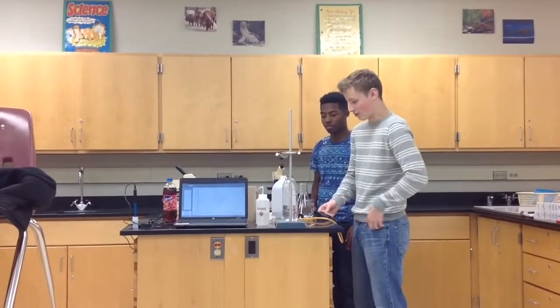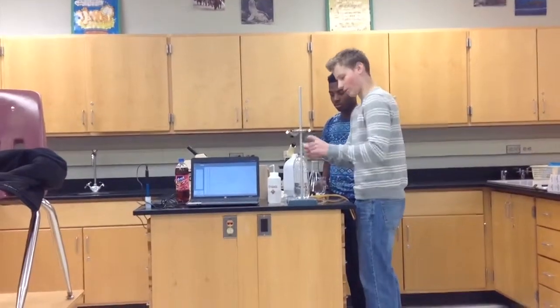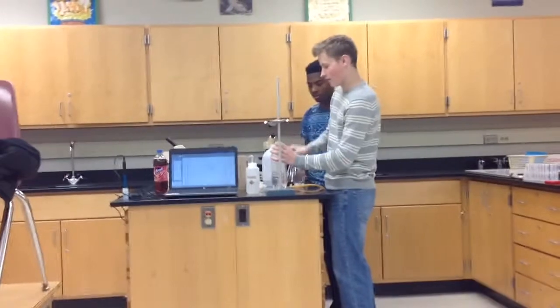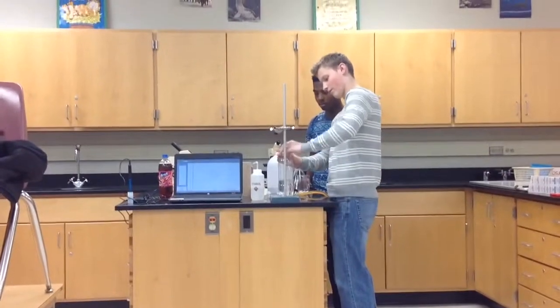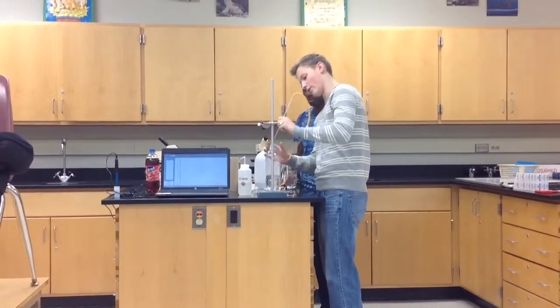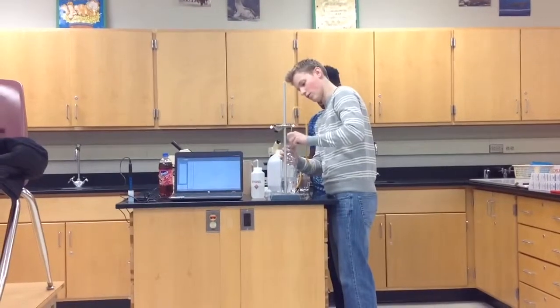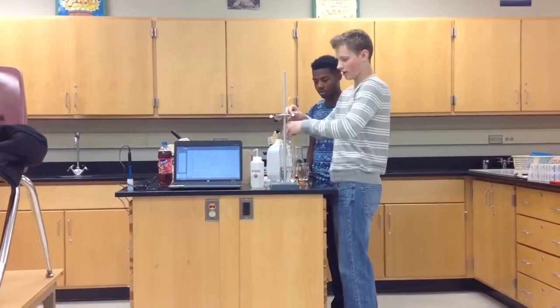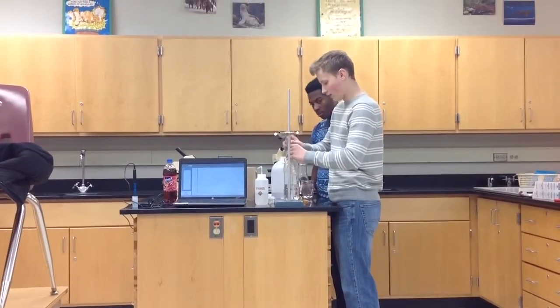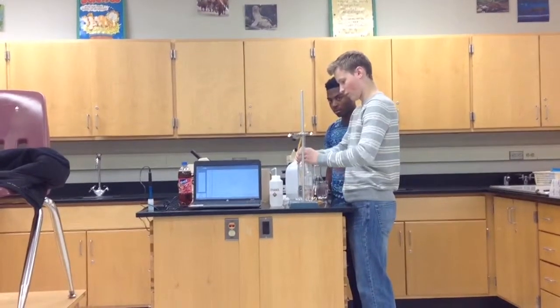Alright, so we're now going to be creating an airtight seal on the bottle with some paraffin. So I'm just going to take the paraffin and basically create ourselves a seal here. And then we're going to take the tube from the beaker which the gas will be traveling through. Create a small hole. And then we're going to take some extra paraffin, just wrap it around this hole to make sure no gas escapes. And we're ready to go.